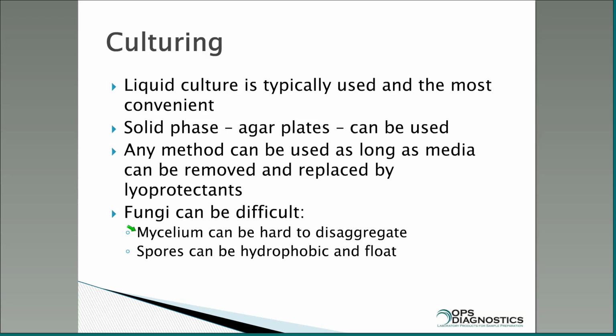Spores are a big headache because a lot of spores are hydrophobic and they float. So if you have a plate, let's say you flush it, you'll find a lot of the spores will float to the top. You just got to shake it up the best you can and try to get the cells to disperse. But you can't really add, let's say, a Tween or something like that to help disperse them, because that will end up hurting your overall freeze drying process.